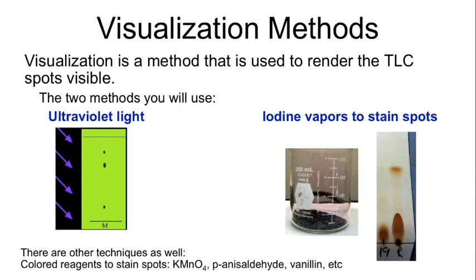In the case of the ultraviolet light, most compounds don't fluoresce. So when you go to blacklight parties or anything like that, you can see all the bright colors and everything. Oh, how trippy and cool. Okay, well, that doesn't quite work for us. So what we're going to do instead is, the TLC plate that we're actually using has fluorescent dye embedded in it already. So when you shine the UV light over the top, that is going to glow this distinct, weird yellow-green color.